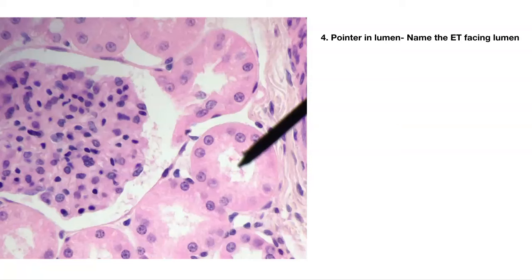Number four. Pointer is in the lumen. Name that epithelial tissue, and tell me where you could find this type of epithelial tissue in your body.